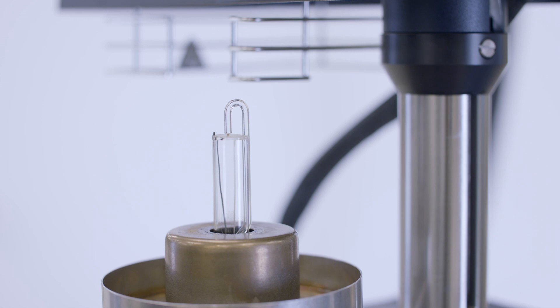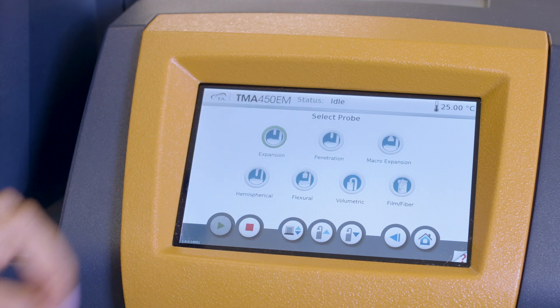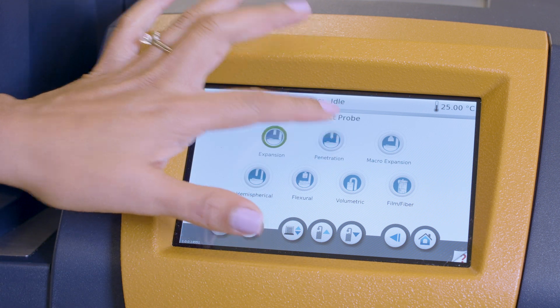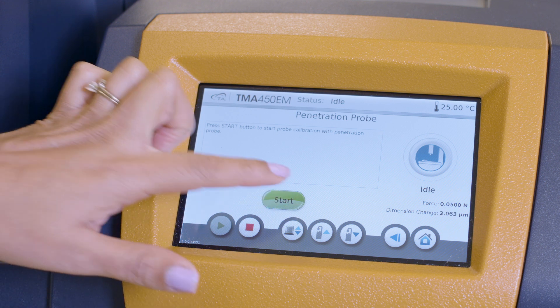Anytime you change probes, you need to calibrate the installed probe. You can calibrate the probe from the instrument touchscreen by selecting Calibration, Probe, and then the icon of the installed probe.